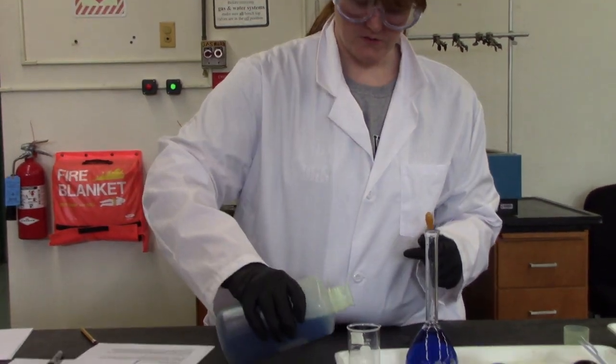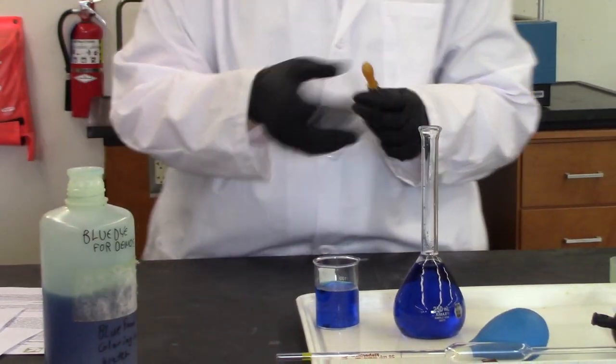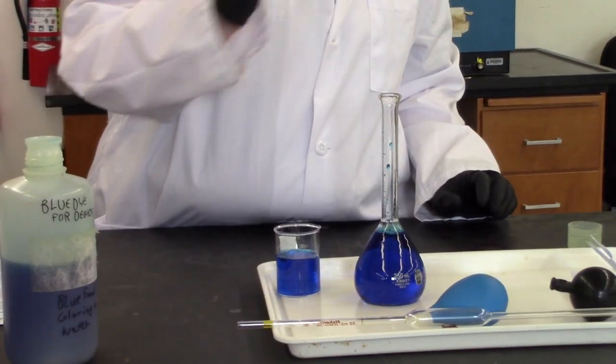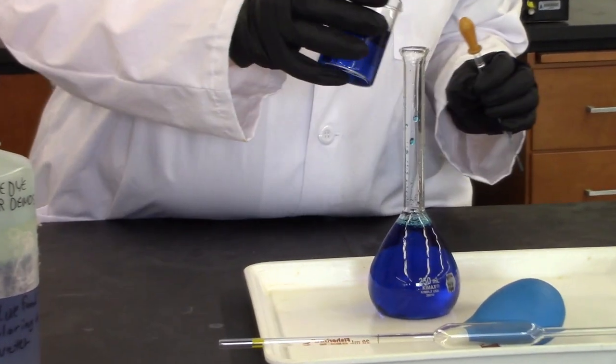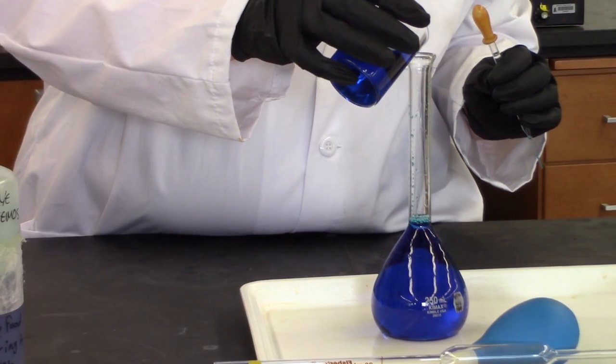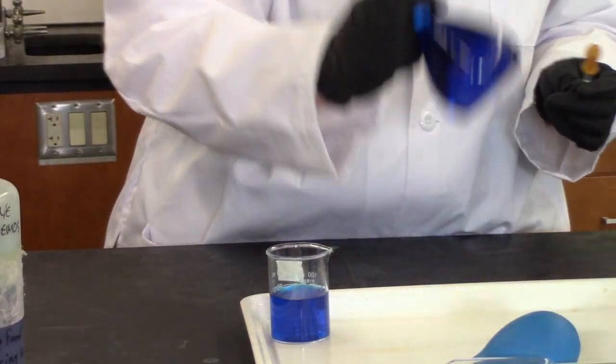So I have a little beaker from the drawer here. I'm just gonna pour out a little bit so that I can pipette, okay? So you're just gonna add it. I think I'm going to put a little more in. Ideally, I don't want to have these little drops all over the place, okay? It takes a little practice to get that down.